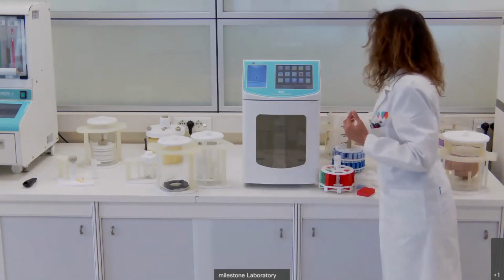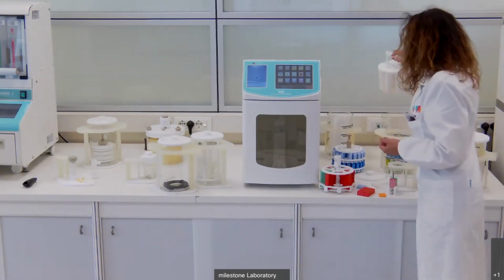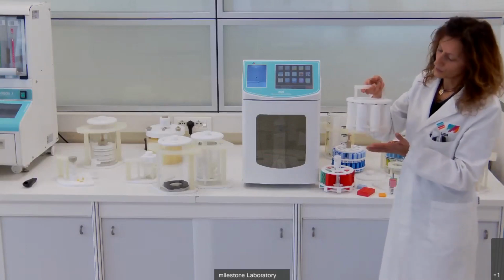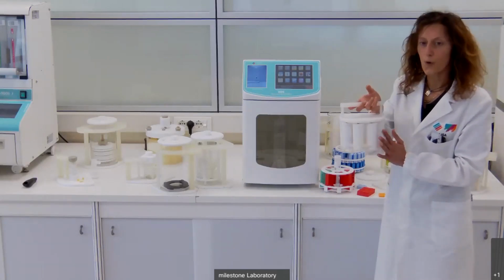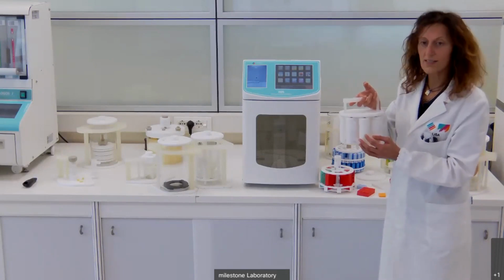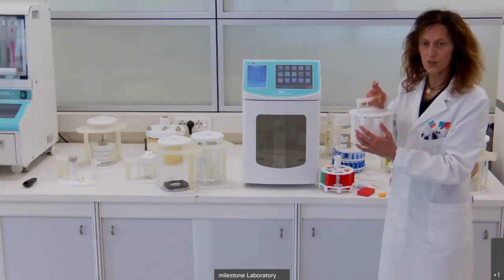Another module that you can use for the decalcification is the multiple decalcifier module. As you can see here, it is composed by different vessels, and in each vessel you can insert the sample with also different reagents.